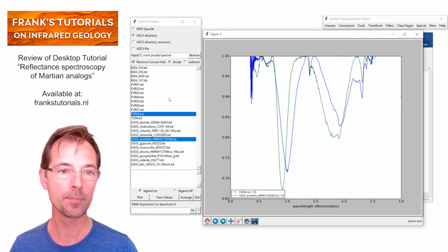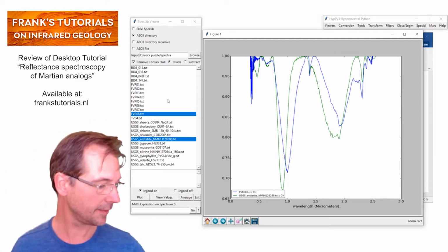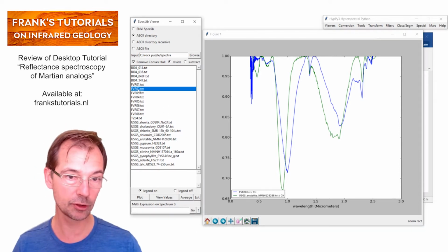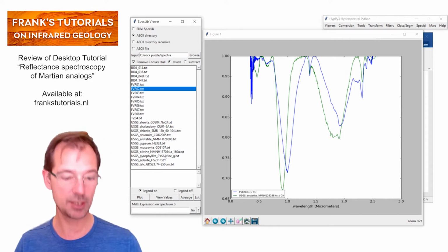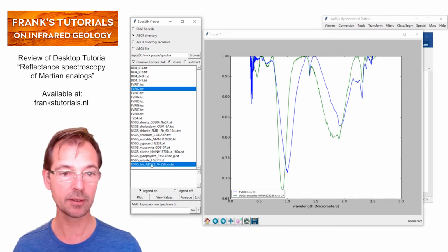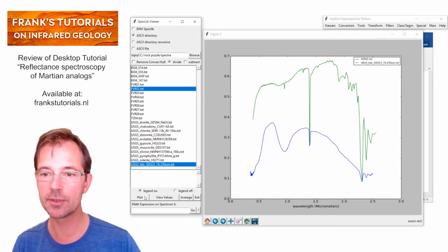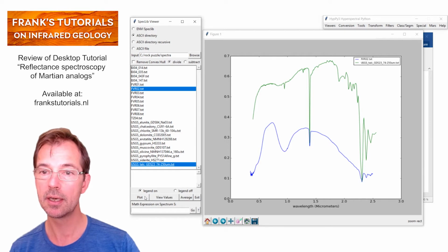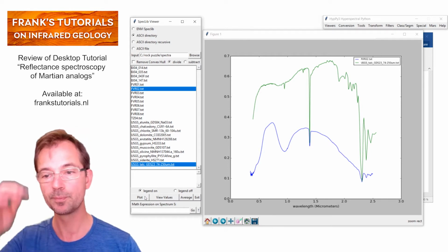we'll use the HypPy hyperspectral Python software, and we open the spectral library viewer. Then I open the unknown spectrum FVR02 and plot it together with a known spectrum of talc from the USGS spectral library. Right, let's do it. This is what we get, the result. In green is the USGS spectrum of talc, and in blue is the unknown spectrum of FVR02.